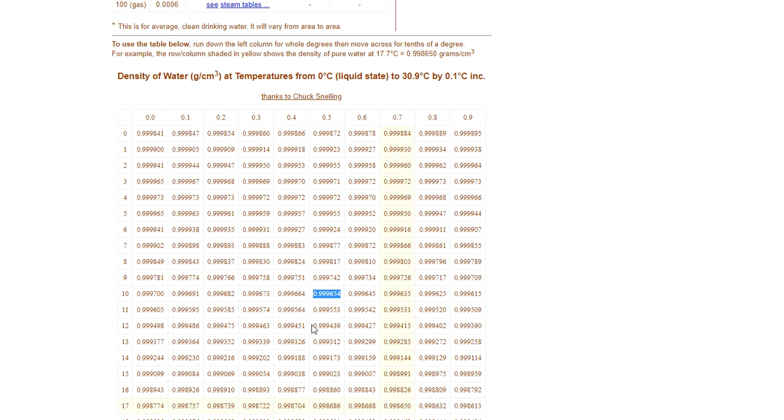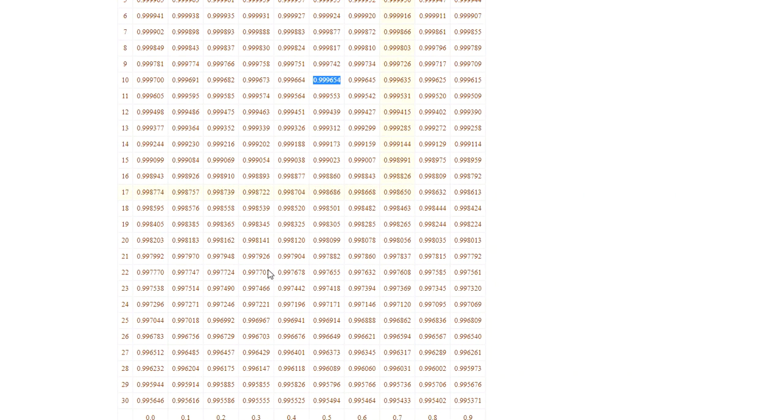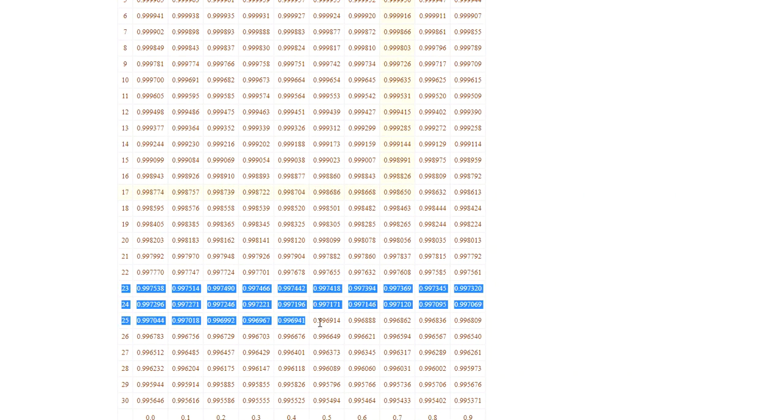So in a general chemistry class, they've lied to you. If you had an instructor that said the density of water is 1, that is false. That is phony. Nowhere on this table do you actually see 1, right? So it's close to 1, but they use 1 because it's pretty convenient. It's pretty easy to remember. However, room temperature is typically about 23 to 25 degrees. So 23 to 25 degrees, these are the rows that we want to focus on. And if you notice, this is further away from 1. We're getting 0.997s and 0.996s. So these are the values of the density of water.